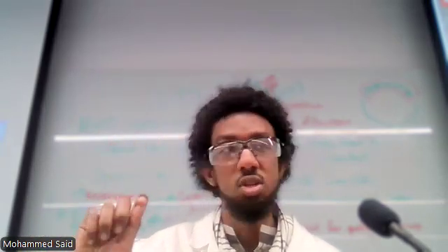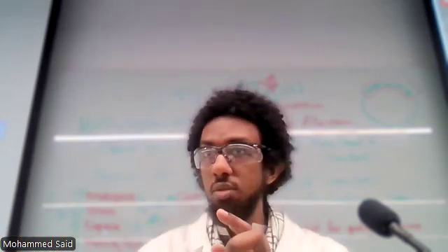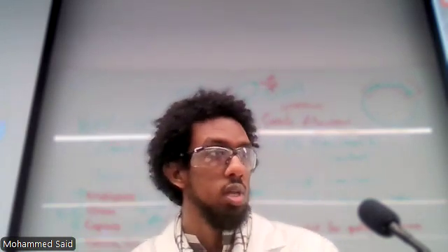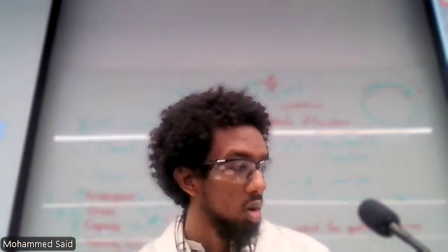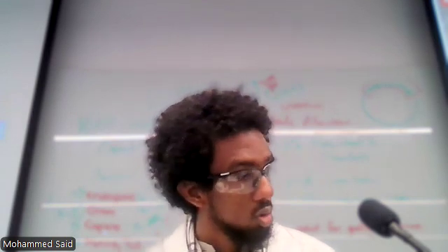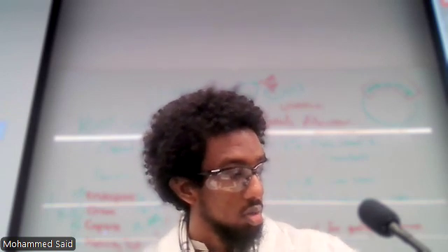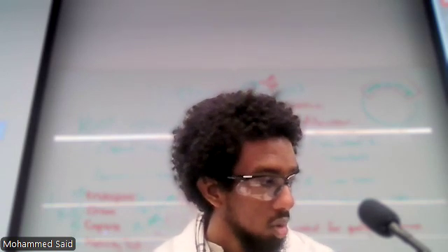Please pay very close attention that you're following instructions, because you don't want to make the mistake of going back into your NA slant with M. luteus and then repeating the streaking of your second quadrant. Rather, you're just doing it from the lower region of your previous quadrant, and you continue going until you're diluting it all the way to the third quadrant, which I know looks odd as a shape.